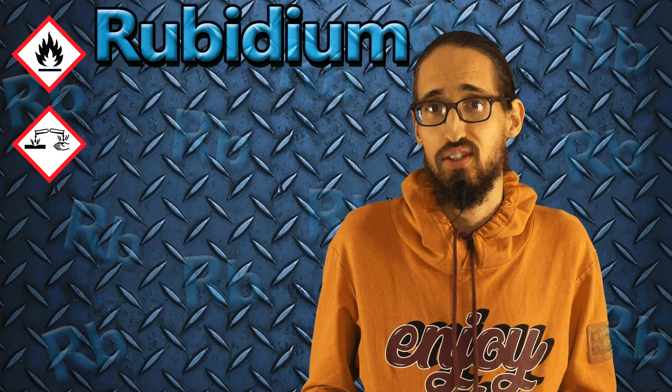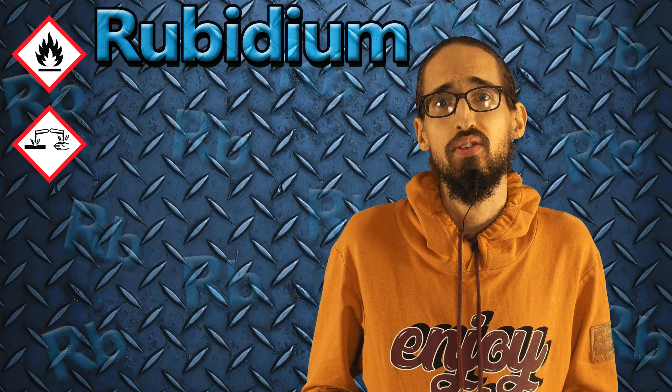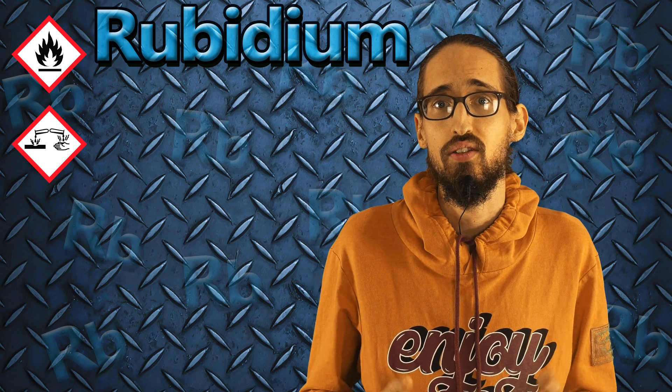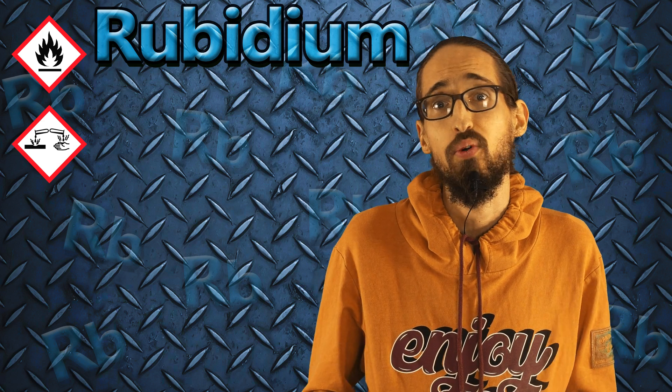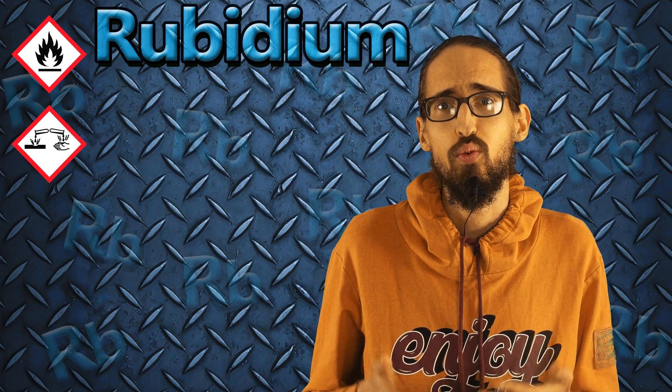As you might have noticed, rubidium didn't self-ignite in air. Rubidium is more similar in its properties to potassium than to cesium. Maybe if that was liquid rubidium, or if I had many grams of the metal, it would self-ignite.